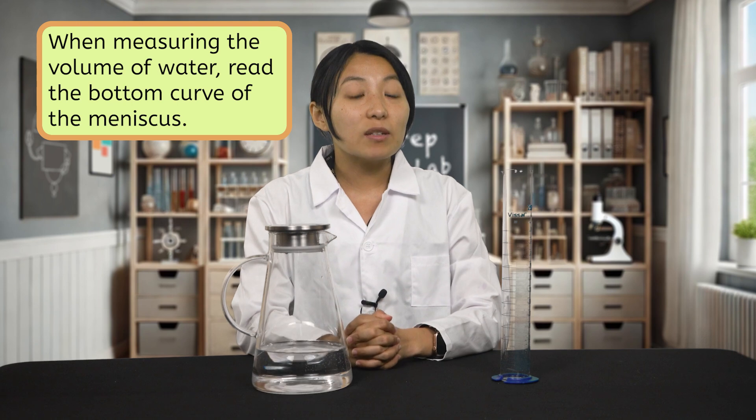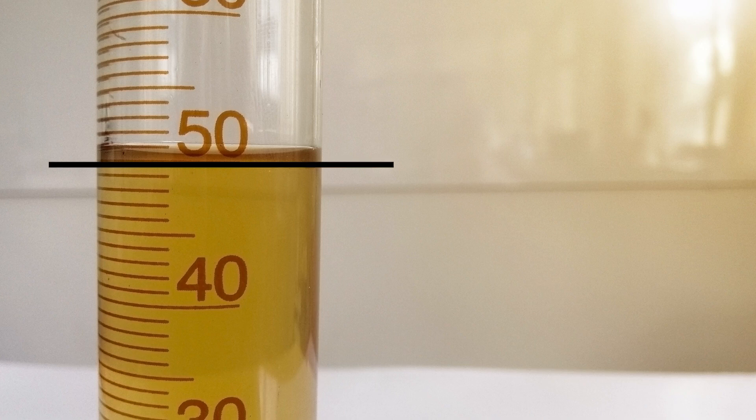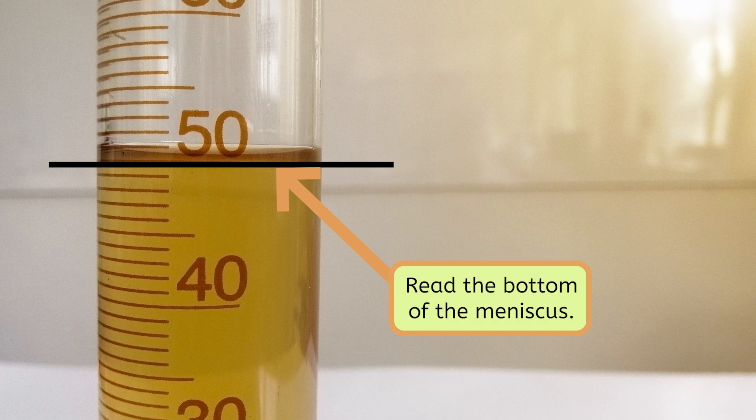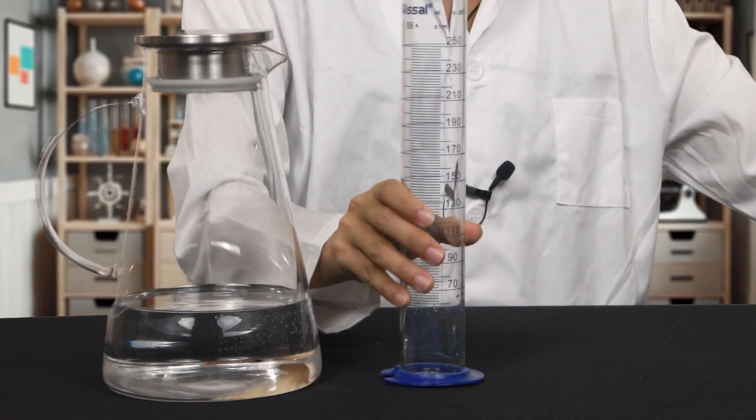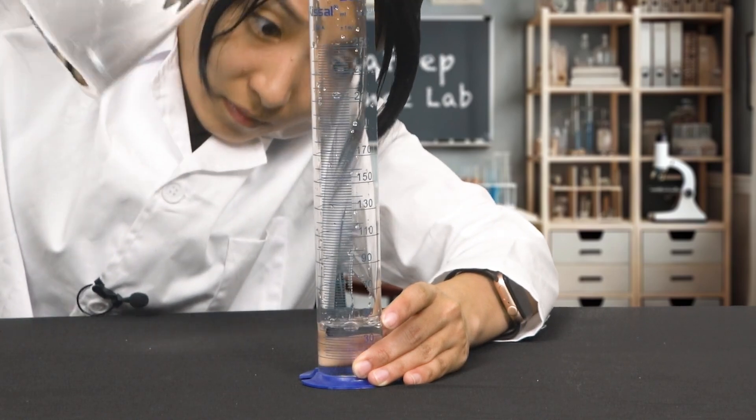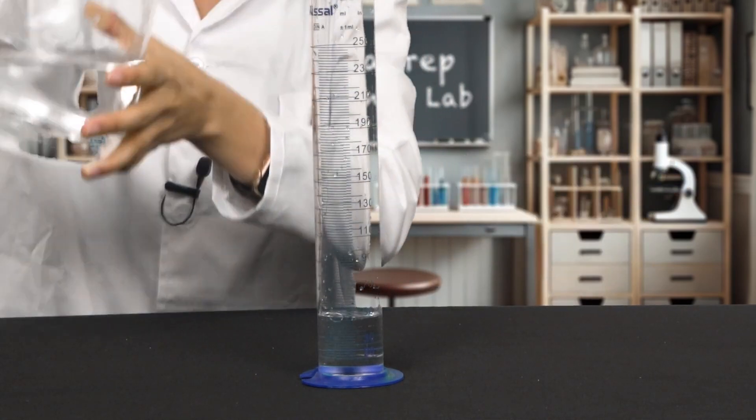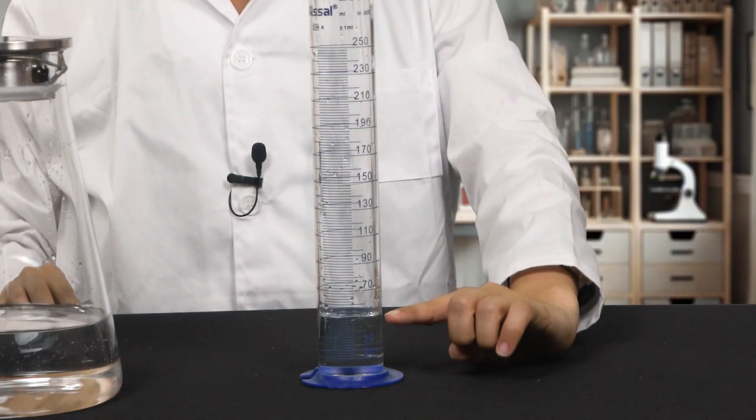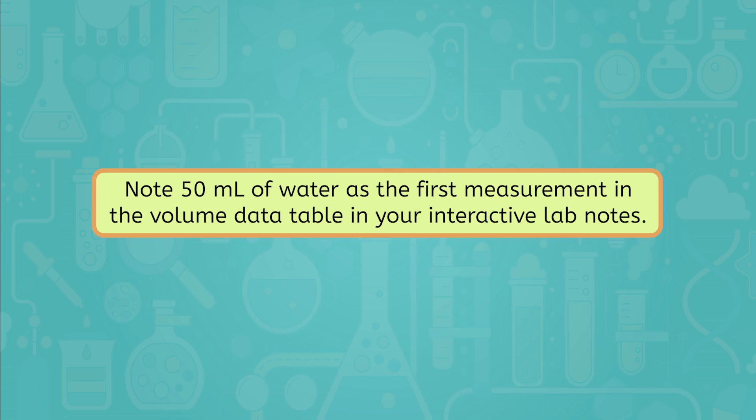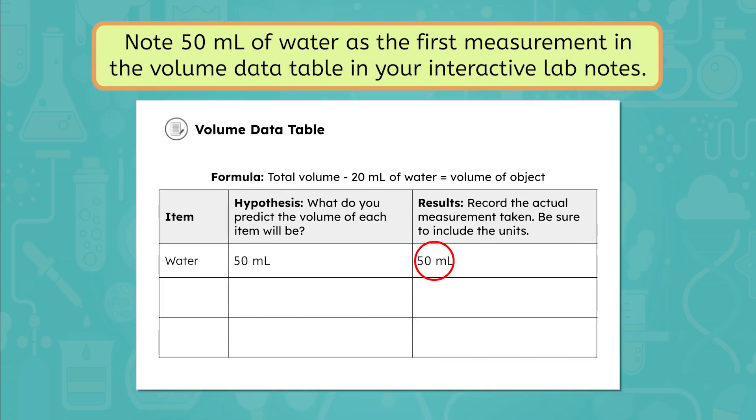To start, we'll practice reading accurate volume measurements by filling our graduated cylinder with 50 milliliters of water. This will be the first measurement to fill out in your data table. When measuring the volume of the water, be sure to read the bottom curve of the meniscus, or water line. For example, we can see that the bottom of the meniscus is at 50 milliliters. When you're measuring your water, be sure to read the bottom of the meniscus at eye level. Place your graduated cylinder on a solid flat surface. This helps keep the water level even. Then slowly fill it with water until the water reaches the 50 milliliter line. When reading the water level, leave your graduated cylinder on the table and get down to eye level with the cup. Looking from above or the side can make the water appear higher or lower than it really is. Once you've filled your graduated cylinder with 50 milliliters of water, note this as your first measurement in the volume data table in your interactive lab notes.